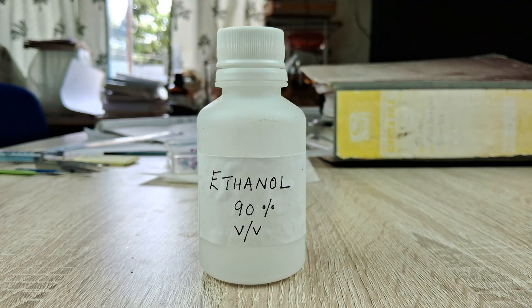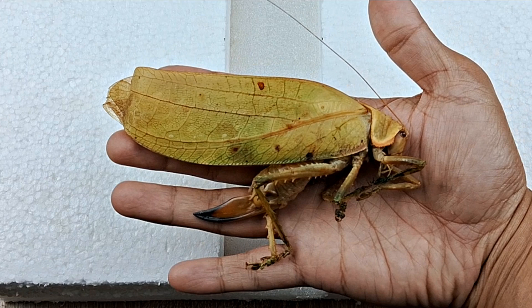You will also need isopropanol or ethanol of 80 or 90% concentration, and of course the specimen — in this case, a giant false-leaf katydid.